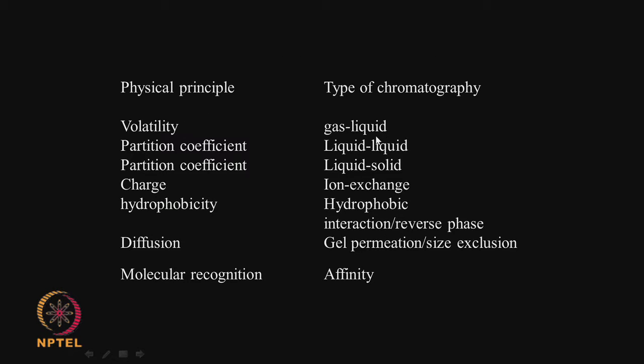So, what is the physical principle? If you look at gas liquid chromatograph, the volatility of the various components present in the mixture, that is the principle. If you look at liquid chromatograph, we are looking at partition coefficient. That means the partition coefficient of the solute in the stationary liquid vis-a-vis the mobile liquid. Okay. That is what it is.